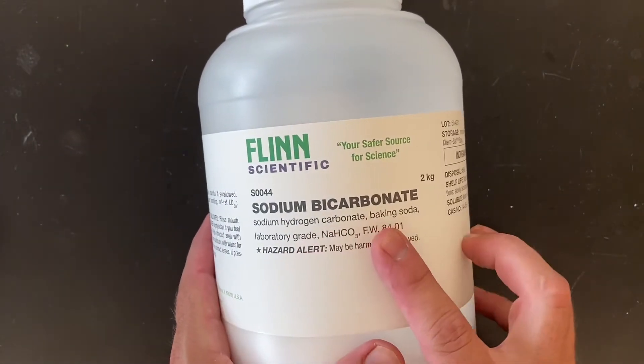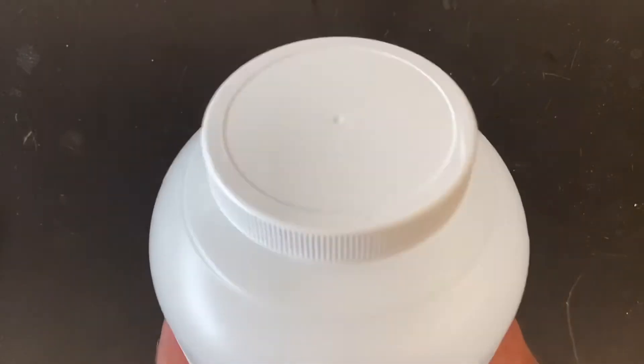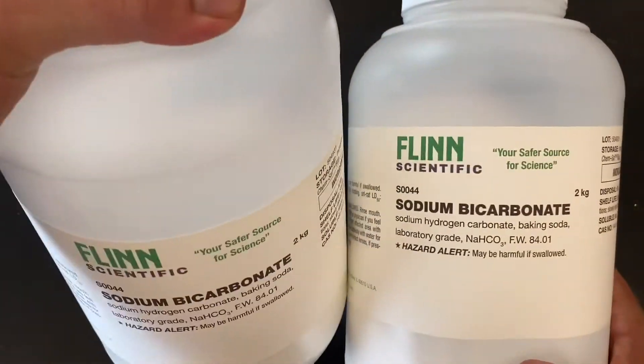Some sodium bicarbonate, also known as sodium hydrogen carbonate or baking soda. This is a two kilogram bottle — we go through a lot of this stuff and we got a couple of those.